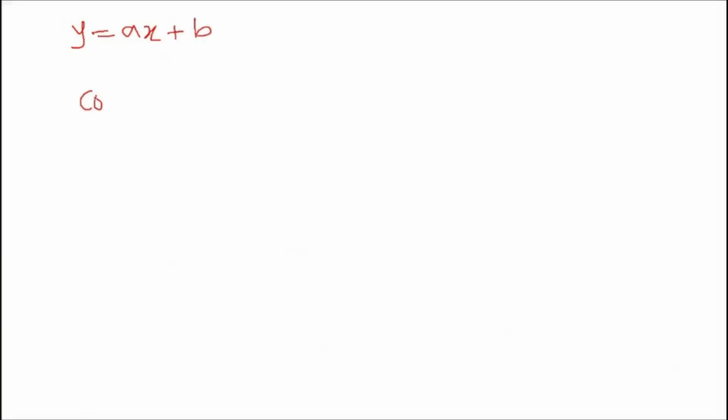Now you have different values of concentration, that is your x values. You have written them down. Now for every value of x, you need to calculate A dash, or let us call it y dash, which is the corrected absorbance. Everyone, I want you to type down so you will remember what A dash or y dash is. It is your corrected absorbance.